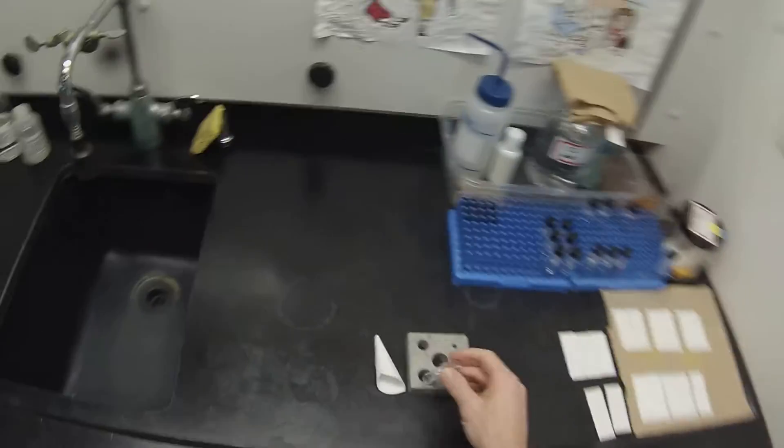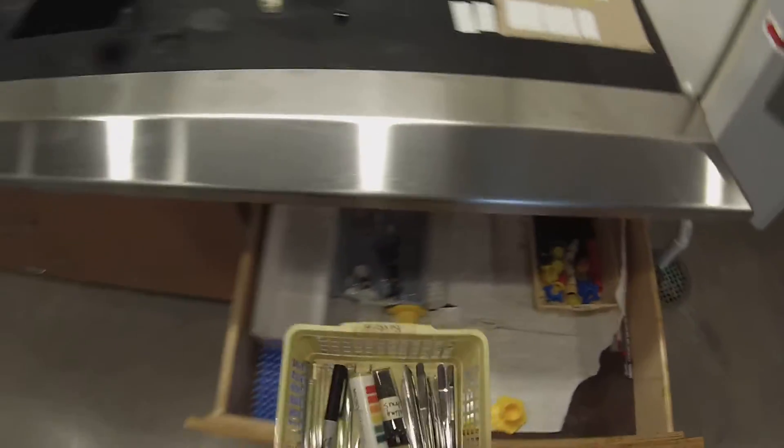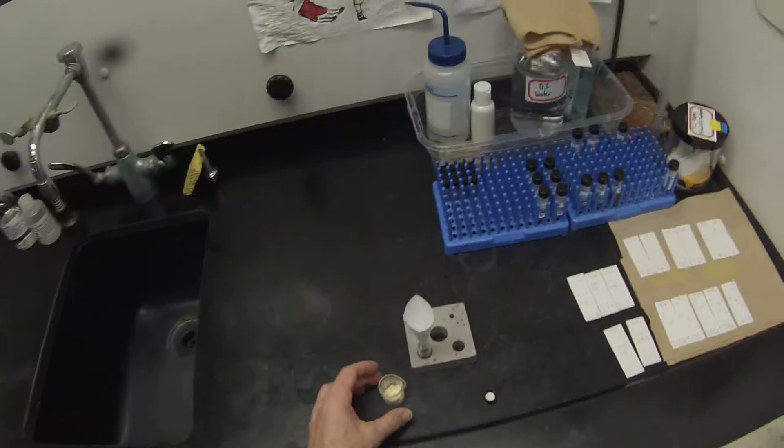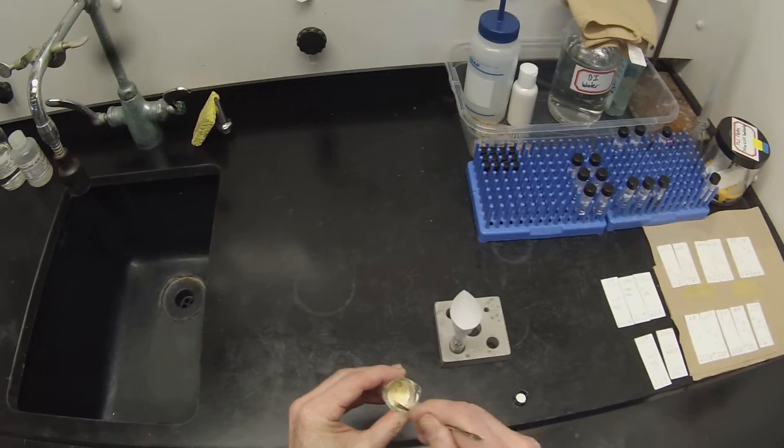Now we're going to sit that in our aluminum block. Stick our little funnel on there. We have a micro spatula. Kind of crunch that up a little bit so we don't get the big chunks to clog the funnel.